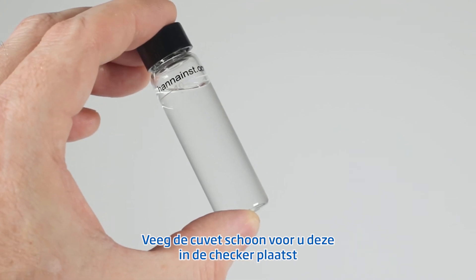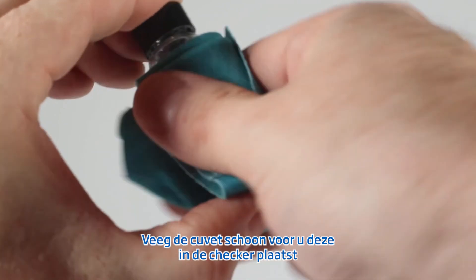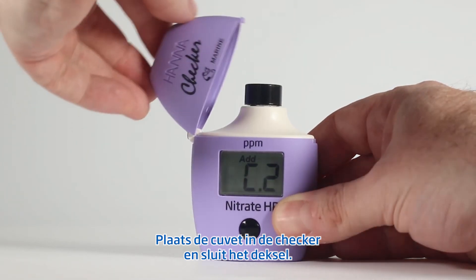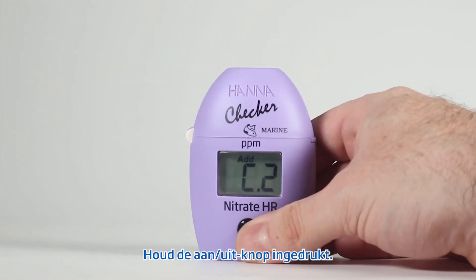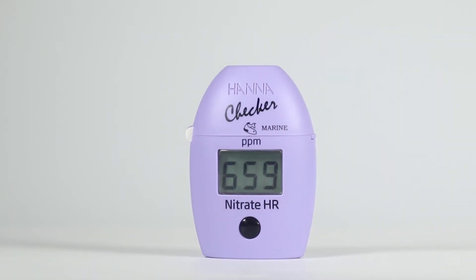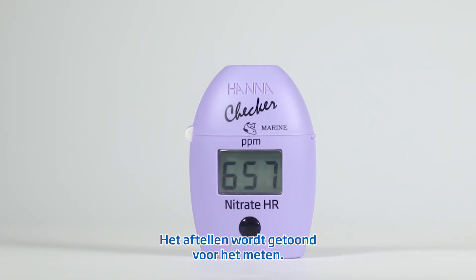Replace the cap and shake vigorously for 2 minutes. Once again, wipe down the cuvette before inserting it into the checker. Insert the cuvette into the checker and close the top. Press and hold the on-off button. The display will show the countdown prior to the measurement. Alternatively, wait 7 minutes and press the button.